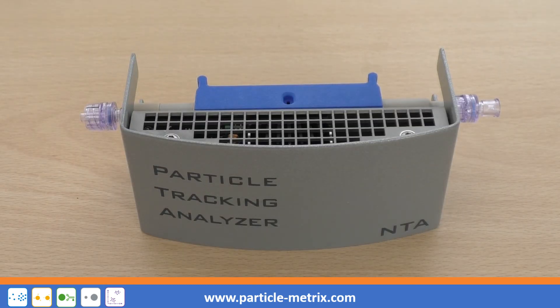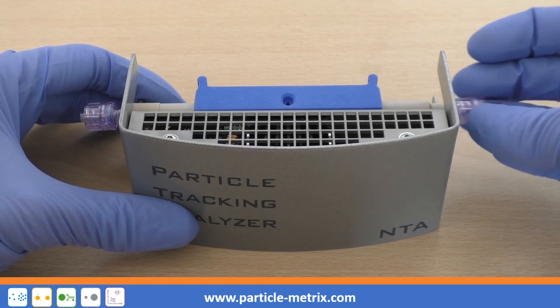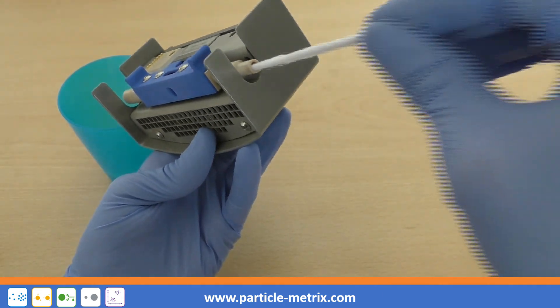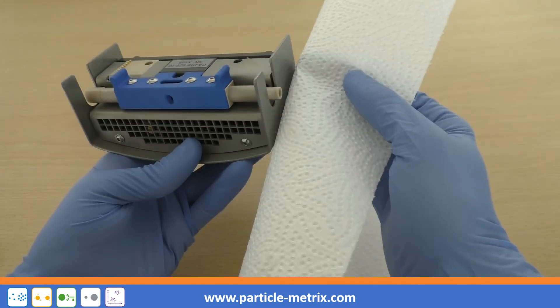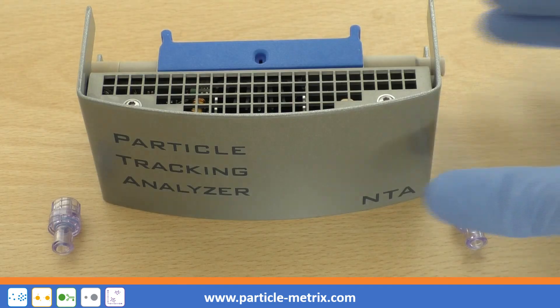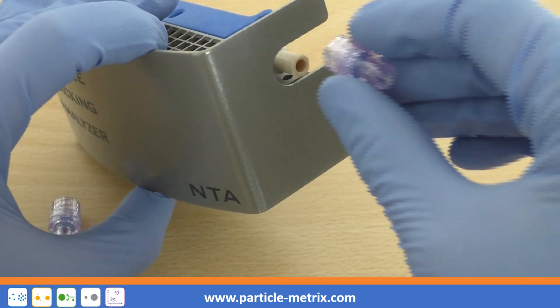To clean the measuring cell of the NTA cell assembly, first unscrew both valves on the right and the left side of the cell. The brush can only be inserted into the larger opening of the cell. Screw the valves back onto the two openings on the measuring cell and make sure you do not generate torsional forces.